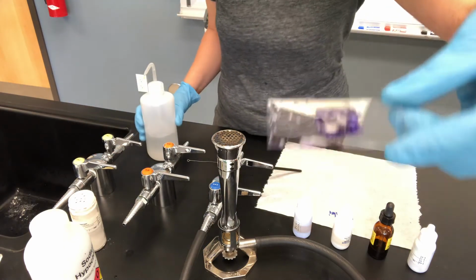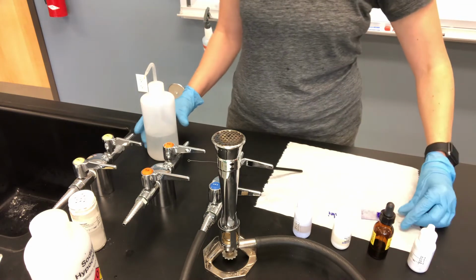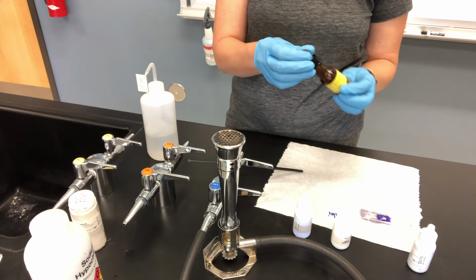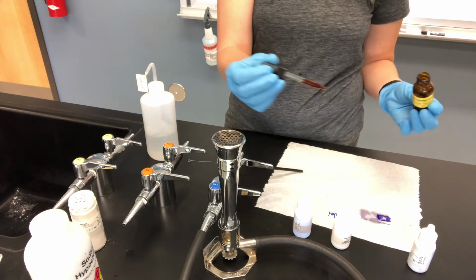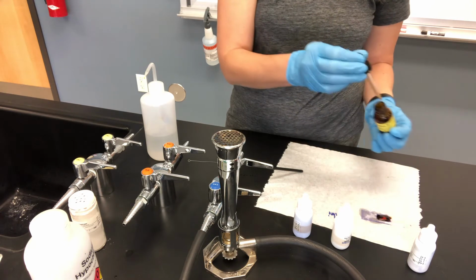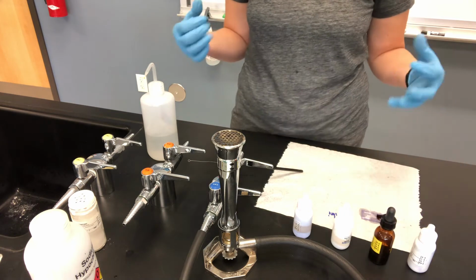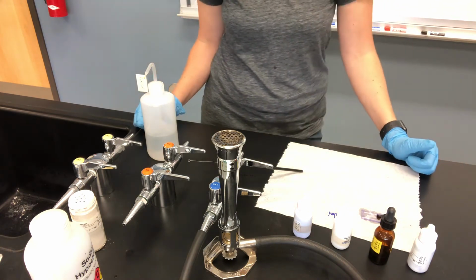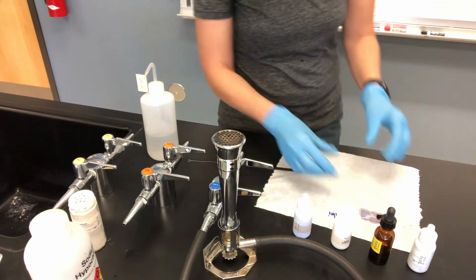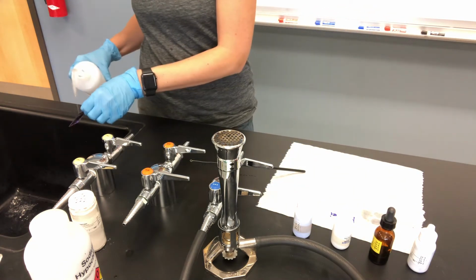Okay, and so here you can see it picked up the purple, right? So then the next is iodine for 60 seconds. You've got your gram's iodine, which is kind of a goldeny color solution. Gram's iodine really makes the crystal violet crystals kind of get bigger and penetrate into the gram-positive cell walls a little bit more. So again, you're doing about 60 seconds of iodine. We're just going to pretend that a minute's gone by. You'll rinse that off in the sink.